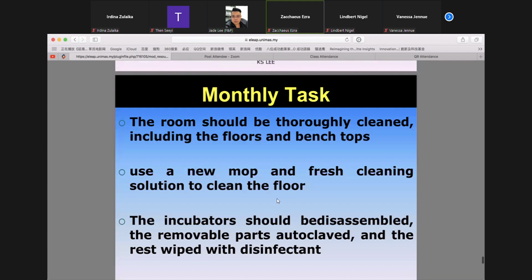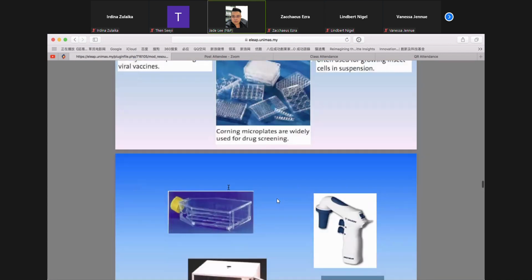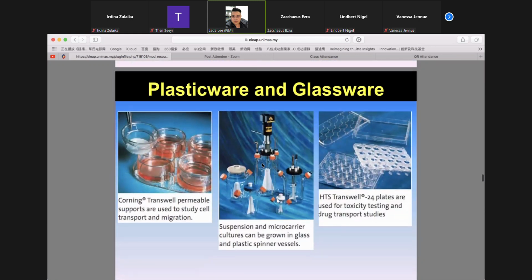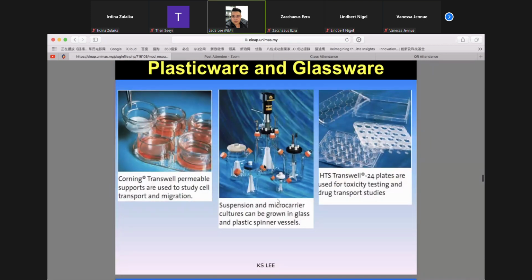Okay, there is a stirrer inside it. Hang on. This one? Yes, doctor. There is a stirrer. You see the white thing? This is a stirrer.